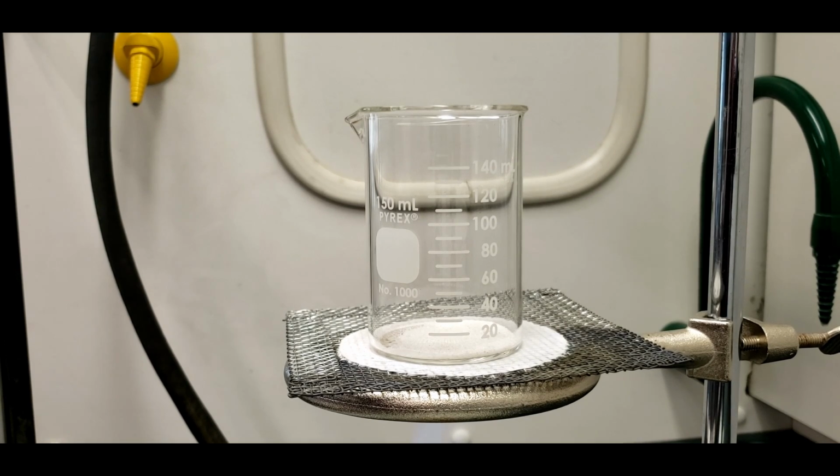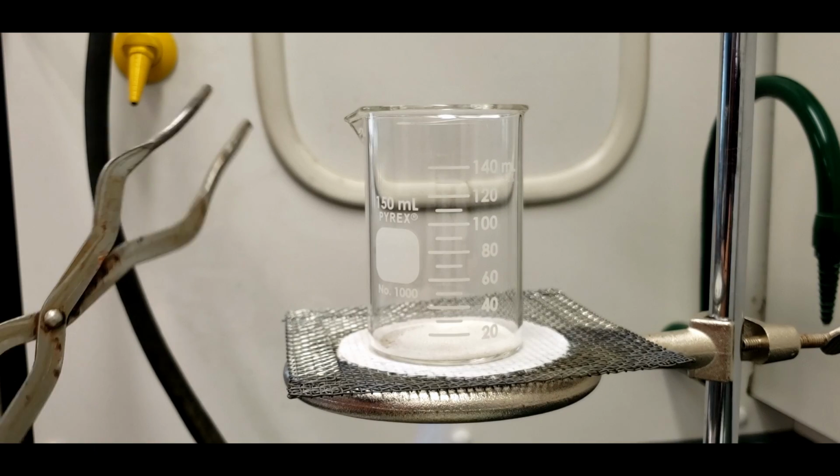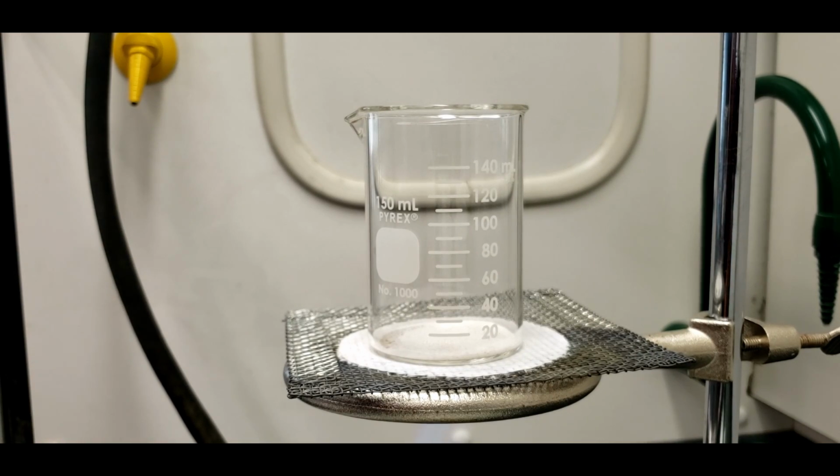So this is after about 10 minutes, and I've been using the crucible tongs to turn it around and doing the little flamethrower trick. And it looks pretty good. I'm going to let it cool in a second. And then once it's cool, weigh it, and then I'm going to heat it another 5 minutes. But I'm pretty sure that I got all of it. But we'll do that little check. After the 5 minutes, if it's still too high, according to the test that they give in your lab book, then I'll have to do a third run. But I don't think that's going to happen.